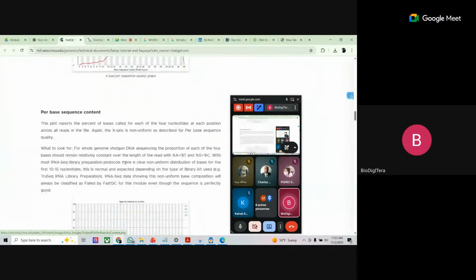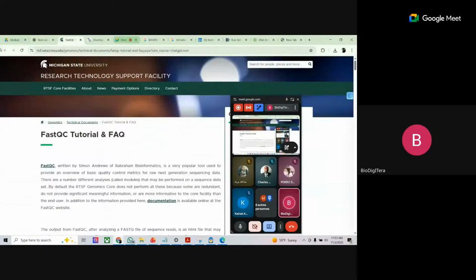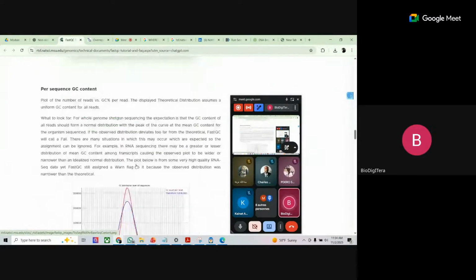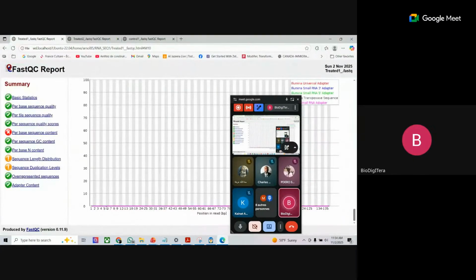This is adapter. No. Adapter. Okay, anyway, I will find another thing to explain. Okay, guys. Normally, I don't. This one is very perfect. Our sample is working well, so I don't know how to explain to you, but I will use this.